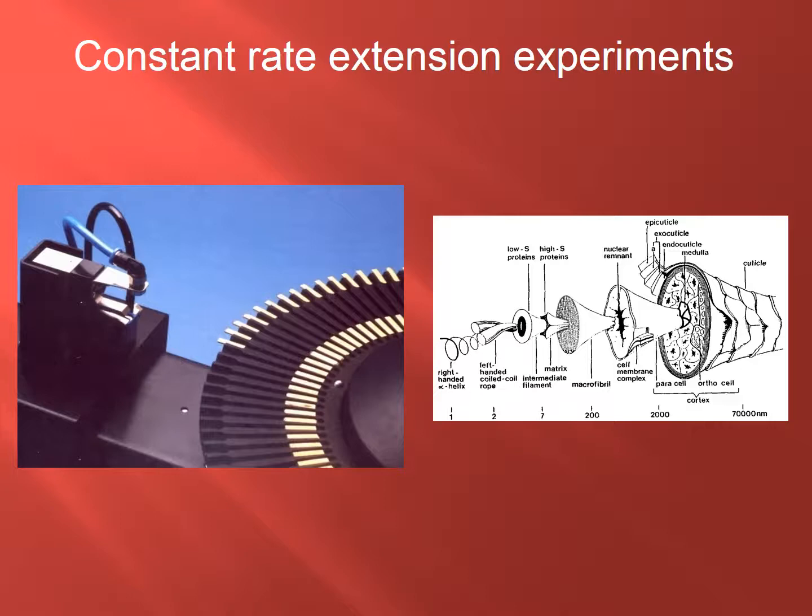Clearly we can't view the condition of the inner cortex structure in the same way we can watch the outer cuticle structure break down, but if the mechanical properties are changing, it must be because the inner structure is also being changed. And normally the reason we're performing these experiments is to investigate decreases in the mechanical properties as a function of exposing hair to all manner of conditions or treatments that are recognized to compromise the protein structure.